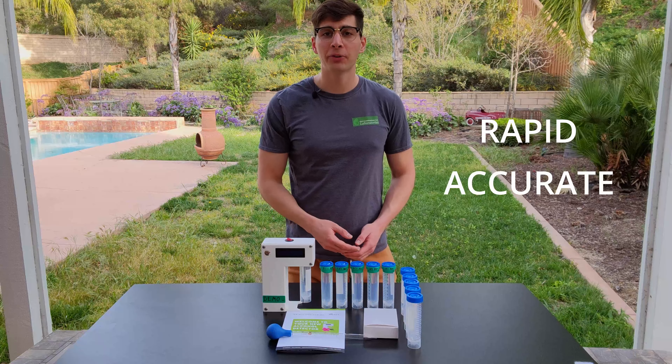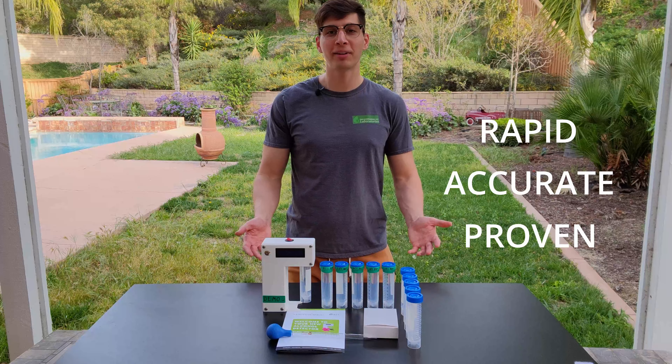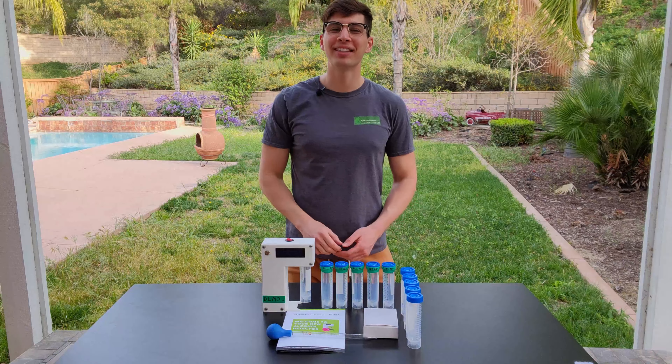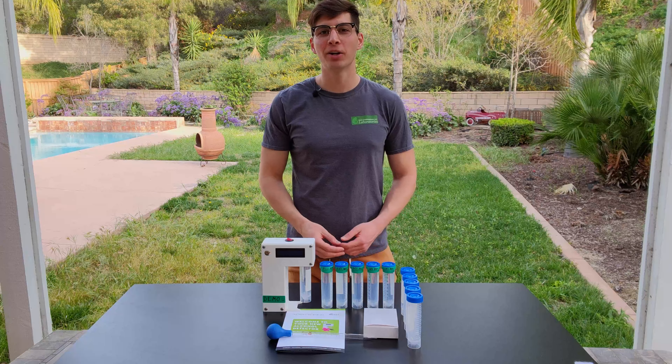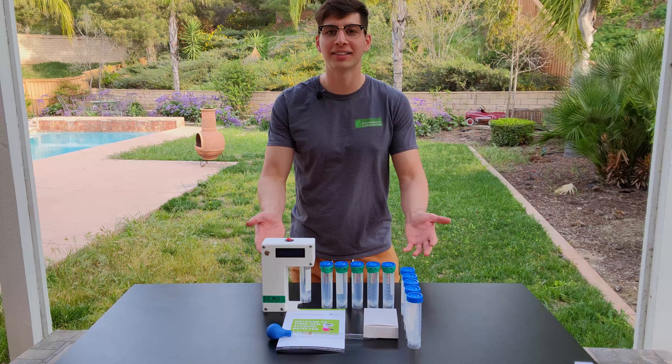If you're looking for a rapid, accurate, and proven way to measure alcohol content, you've come to the right place. Hi, my name is Nick Robertson, founder and CEO of Rare Combinations, and today I'd like to introduce you to my new alcohol content detector.